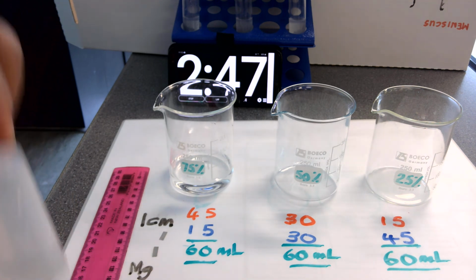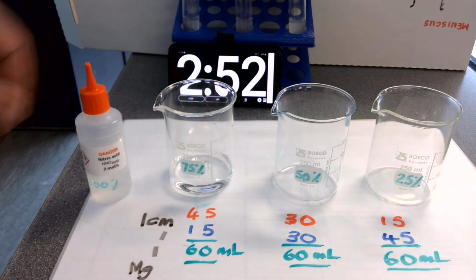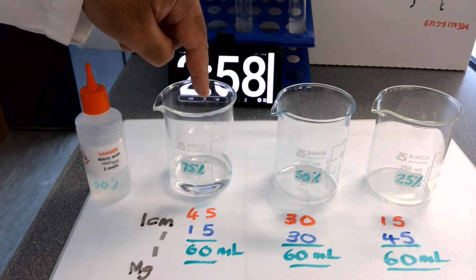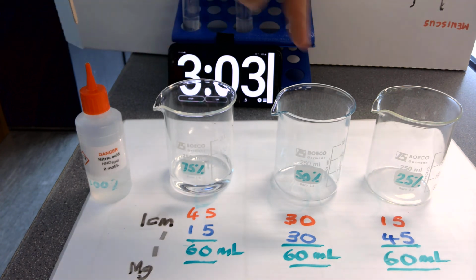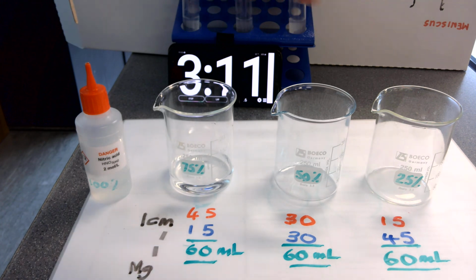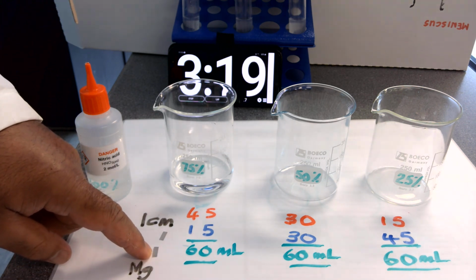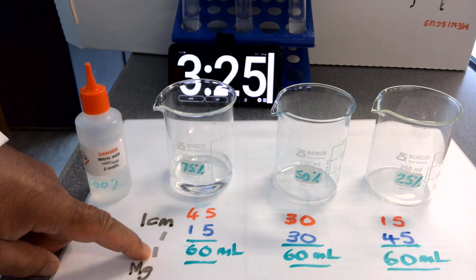So there, as a summary, we have 4 different concentrations of acid. The original concentration we're calling 100%. We then dilute that concentration of acid to 75%. We then dilute the original concentration of acid to 50%. We then dilute the original concentration of acid to 25%. We then use each of those different concentrations of acid to run 3 separate reactions, and we keep the second reactant, magnesium metal ribbon length, the same throughout, 1 centimetre.